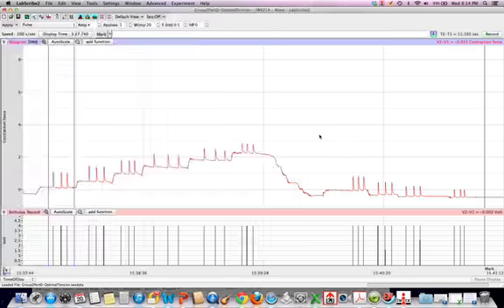Alright, so the first part that we're going to want to do is put the 2 cursors so that we're measuring from peak to trough on each of these different points. So for example, this cursor is placed here, this one's here. We can note the voltage, or the V2 minus V1 tells us the contraction force here at 0.915.